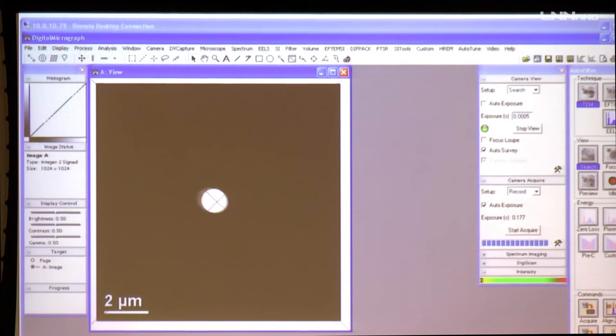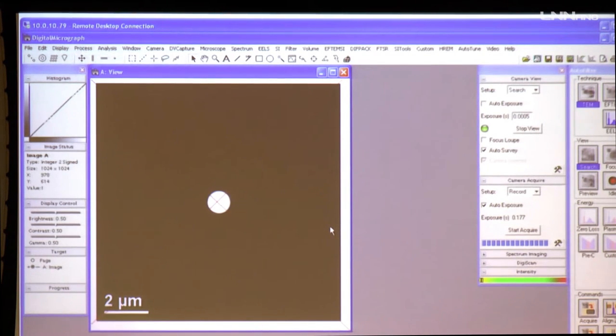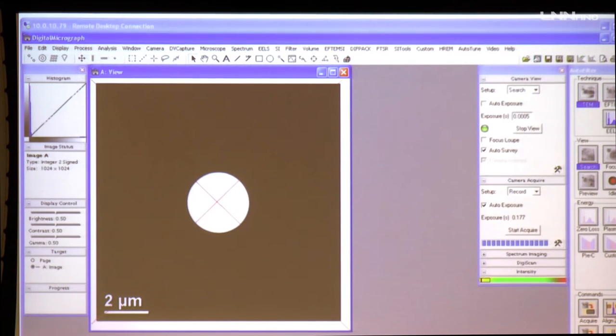now the pivotal point is not good because you see the wobble properly. By changing the current across the compensator, I need to correct this wobble. Now I have eliminated all the movement. So that indicates my pivotal point is set. So in this way, we need to do it. Once the beam is not moving, we can take off the wobbler, tilt X and compensator.